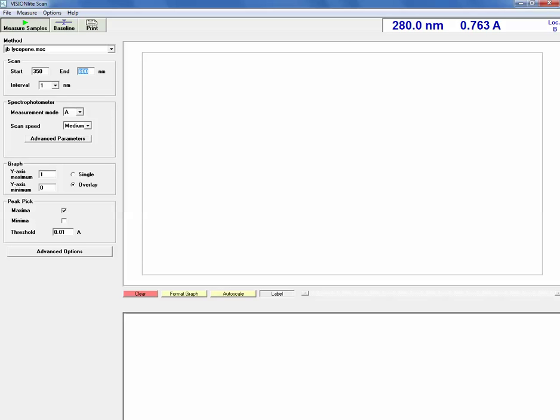We're not going to rely on you to make that judgment. So we'll at least give you the window so you know what numbers to start at. The interval, right now it's set at 1 nanometer, which means that it has the distinguishment between 254, 255, 256. I can change that sensitivity though.